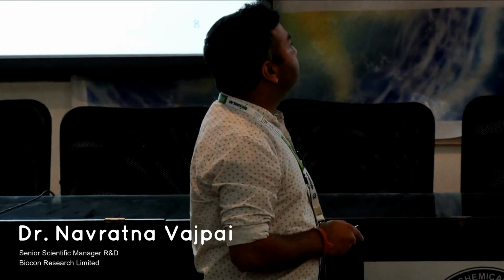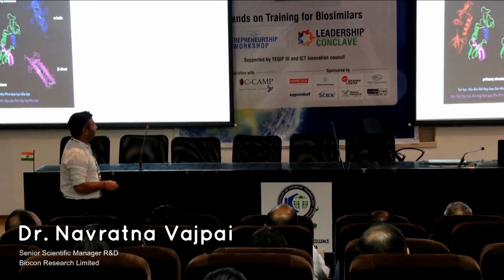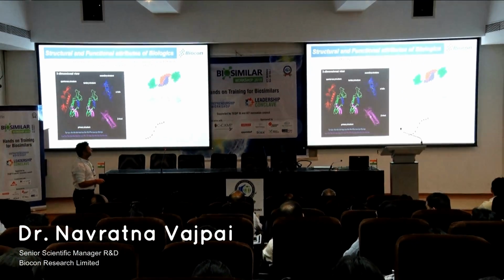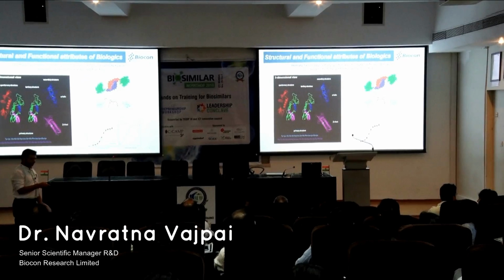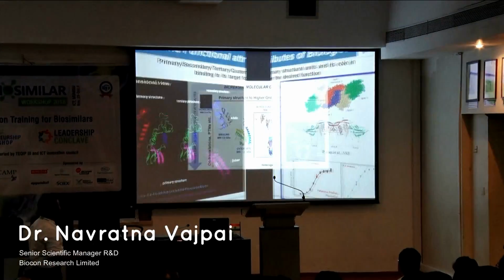Okay, so different structures, all of you know now after 5 or 6 presentations, different primary, secondary, tertiary structures, what they constitute and how they are all called HOS. And of course, if your product and the innovator match very closely, you see similar binding curves, which essentially means that if they are the same, you get a fairly similar idea.